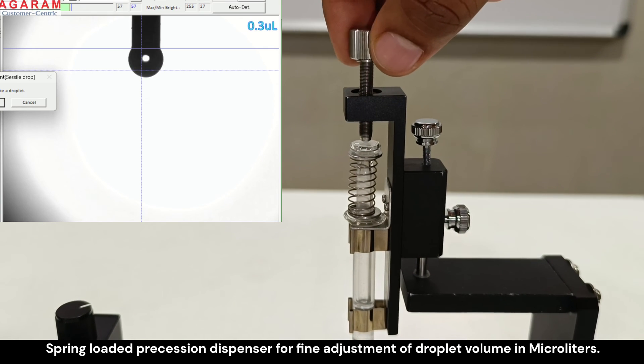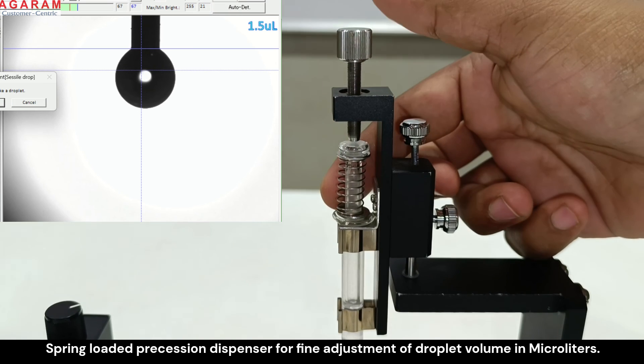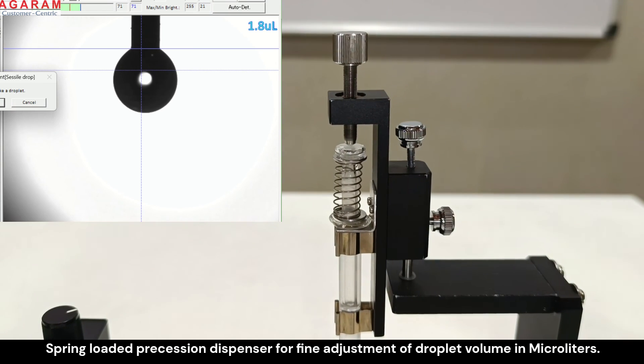A spring-loaded mechanical dispenser to control droplet volume precisely.